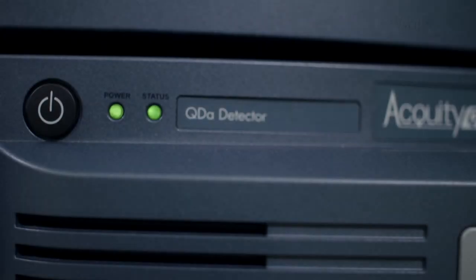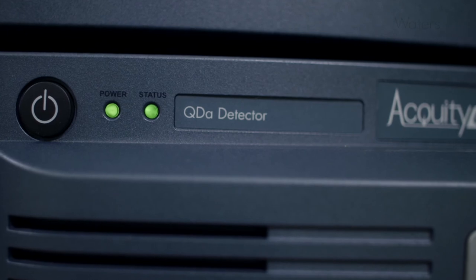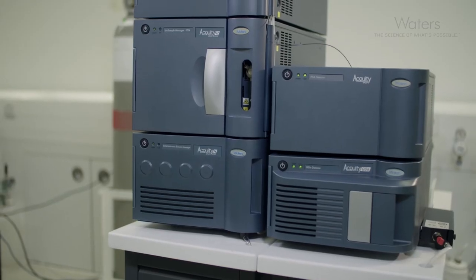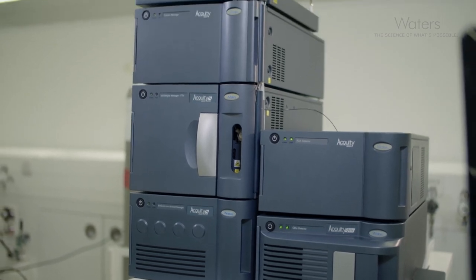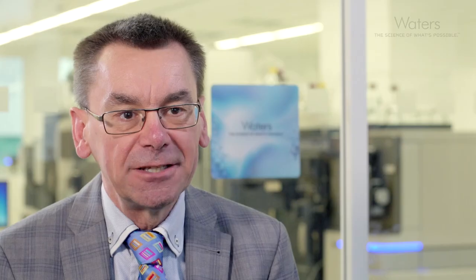In summary, the Acuity QDA detector provides real added value to chromatographers across a wide range of applications. And it is designed to be used and maintained just like a traditional optical detector for effortless adoption into any chromatography laboratory.